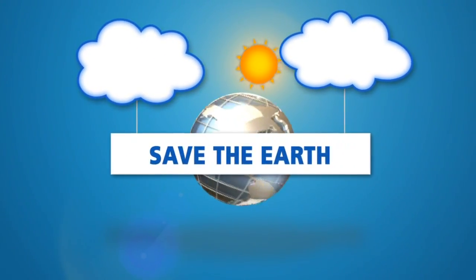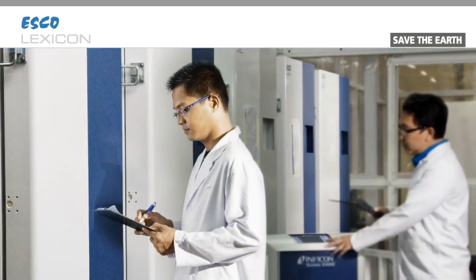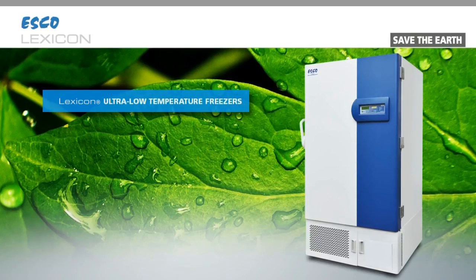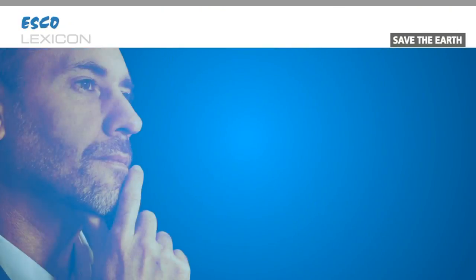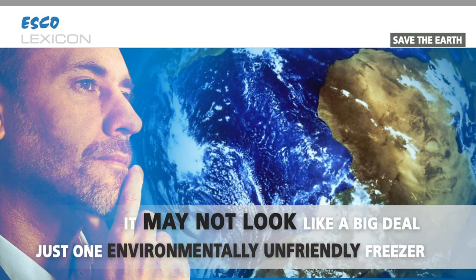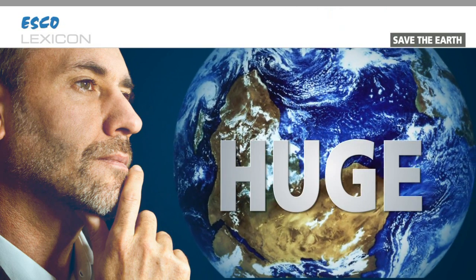Save the Earth. By being more energy efficient, I am also reducing the carbon footprint and contributing to the green movement. The refrigerants flowing in my leak-free copper evaporator are CFC and HCFC free and ozone friendly. It may not look like a big deal to buy just one environmentally unfriendly freezer, but the cumulative burden of close to one million ultra-low temperature freezers around the world on our Mother Earth could be huge.